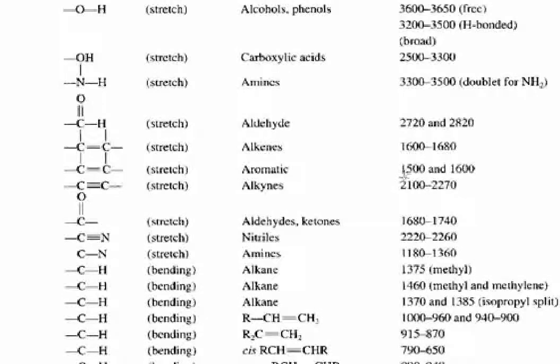There are actually two bands we tend to see, two peaks, around 1500 and around 1600. Now, remember that these two peak values, 1500 and 1600, tend to be indicative that you have an aromatic compound, and it's caused by this CC stretch in the aromatic ring. Well, the next entry is a CC triple bond stretch. It is found between 2100 and 2270.